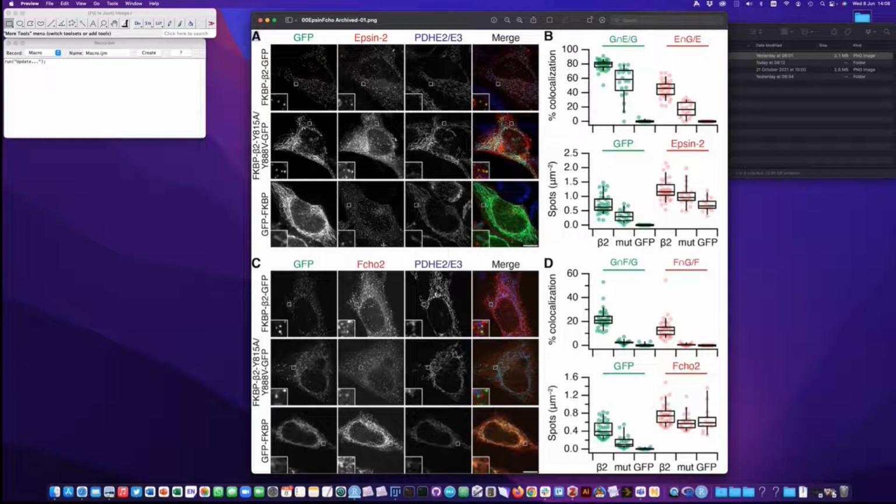So what I'm showing here is a figure. Actually, the final figure looks a bit different to this, but it's just an example. And what we're going to do today is to generate one of these montages that you see here. This is a typical sort of microscopy experiment that's been done. And just to explain, the way we have our figures is we would make them in something like Illustrator, but we would put this in as an entire object. This is one object here, and this is one object here. So we would make two files here for the images and just place them, embed them directly in Illustrator. So the point here is we make one flat image per panel.